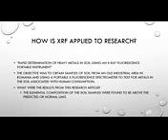This technique is discussed in a peer-reviewed research article, Rapid Determination of Heavy Metals in Soil Using an X-ray Fluorescence Portable Instrument.